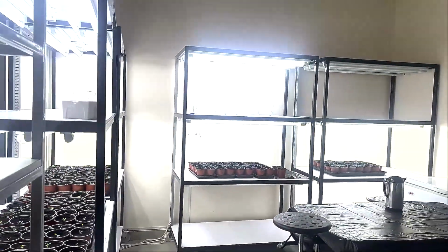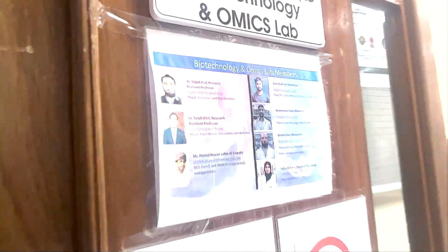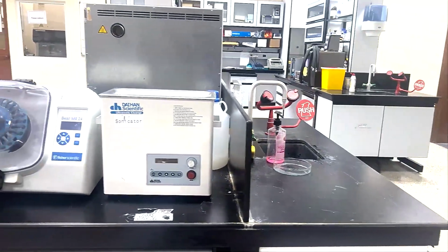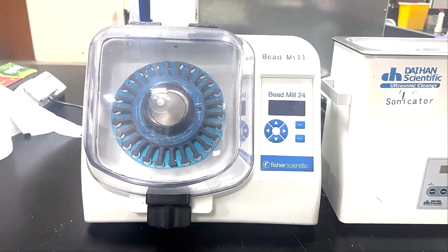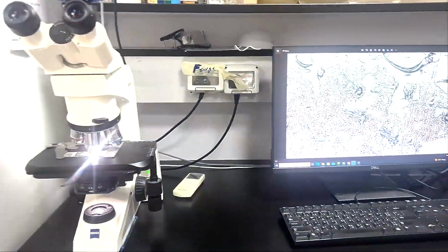Now we will go to the lab. You can see this is the main entrance of our lab. You can see our team member here, and we have different types of facilities in our lab. You can see this is the sonicator, and we are using it for sonication, and this is the latest microscope.